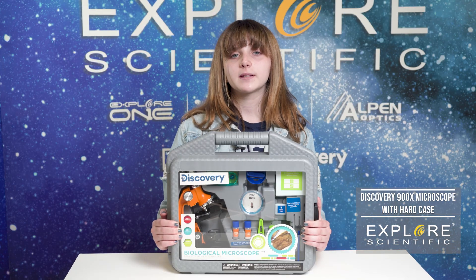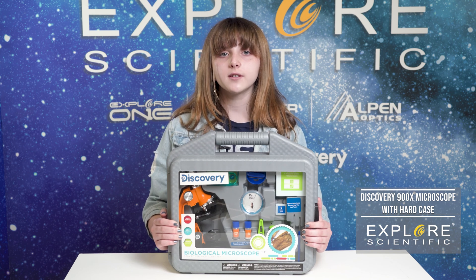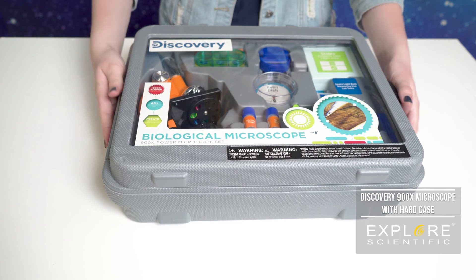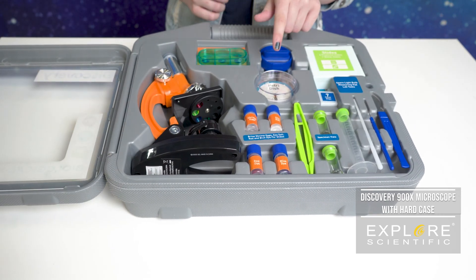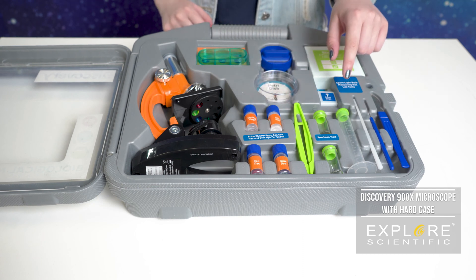Hi, my name is Levine Nassar from Explore Scientific. Today I'm going to show you the Discovery 900x Biological Microscope Set. In this kit, you're going to get your microscope, a hatchery, a petri dish, dyes, specimen vials, prepared and blank slides, and other tools.